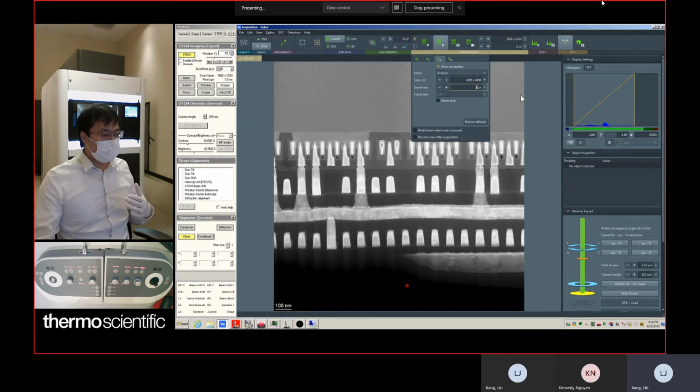So with the imaging, any noise, some people walking around, even somebody talking, some environmental construction going on, might bring noise to your scanning, to your imaging. So keep that in mind. It's better to do long scanning during the night. In that case, you minimize the environmental noise.